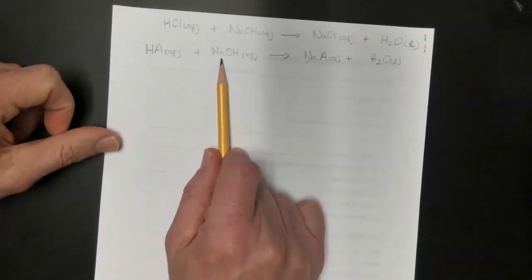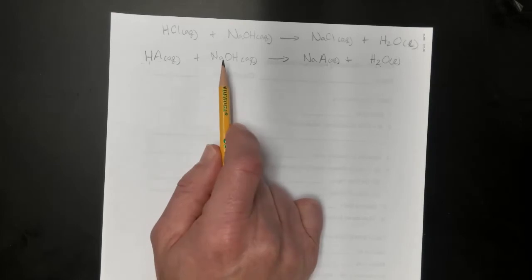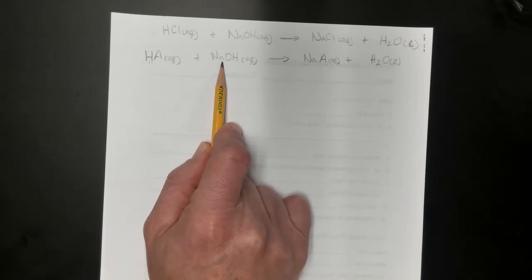Okay, so titration. Suppose we have a solution of sodium hydroxide, right here, but we don't know its concentration. We're unaware of its concentration. But we can take KHP, potassium hydrogen phthalate, we can weigh that out, determine the number of moles of potassium hydrogen phthalate, and then add sodium hydroxide carefully to this potassium hydrogen phthalate mixture until all of the HA, all of the acid, is reacted. Right? And so since this is 1 to 1, if we know the number of moles of acid we started with, we know the number of moles of sodium hydroxide it took to react with all the acid.